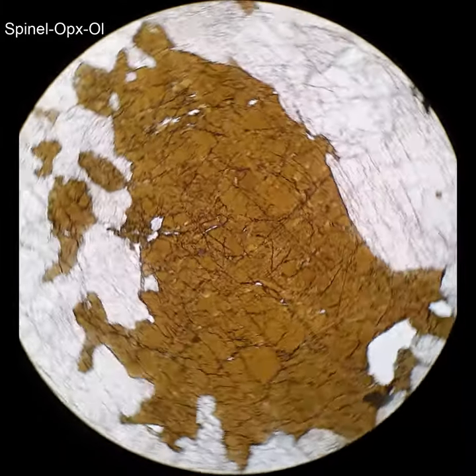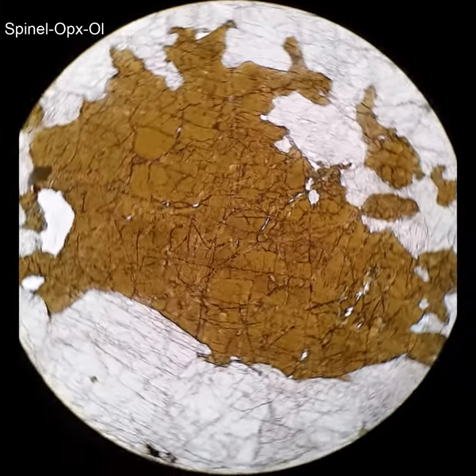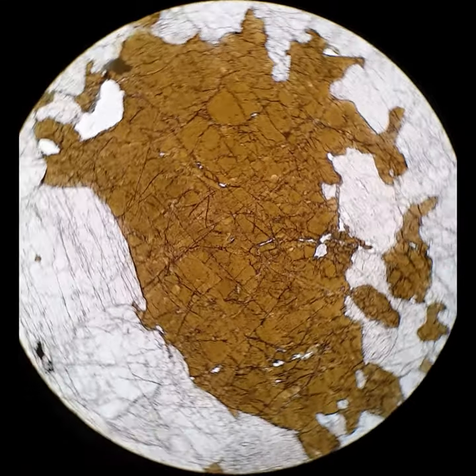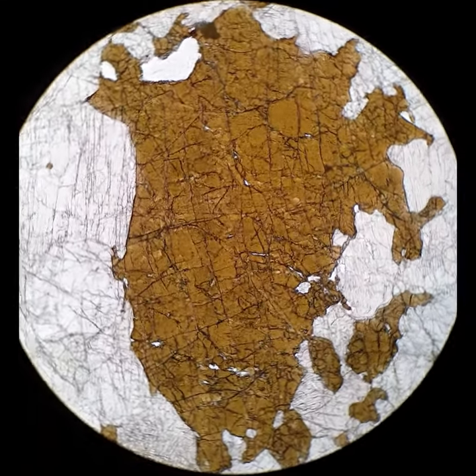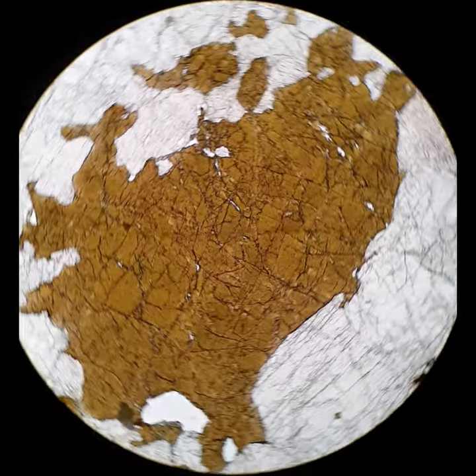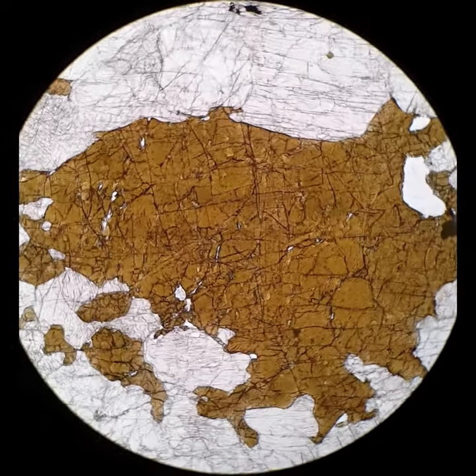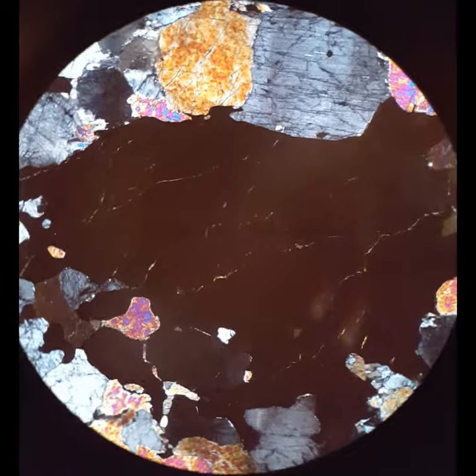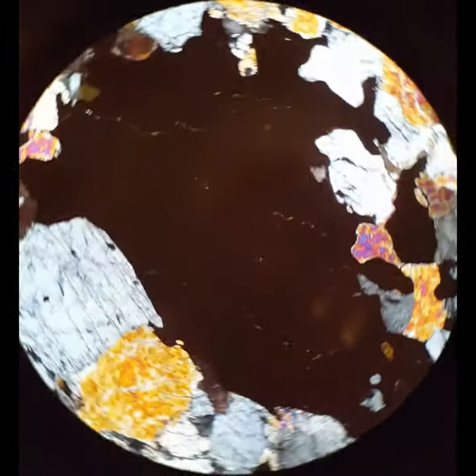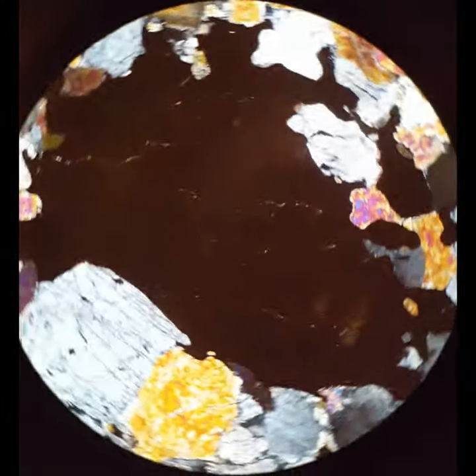And finally one really big spinel crystal in the spinel peridotite. Remember that peridotites typically have only one aluminous mineral. At shallow depths it would be plagioclase, although plagioclase peridotites are rare. Spinel peridotites form at intermediate depths — they're pretty common. And garnet peridotites form at greater depth.